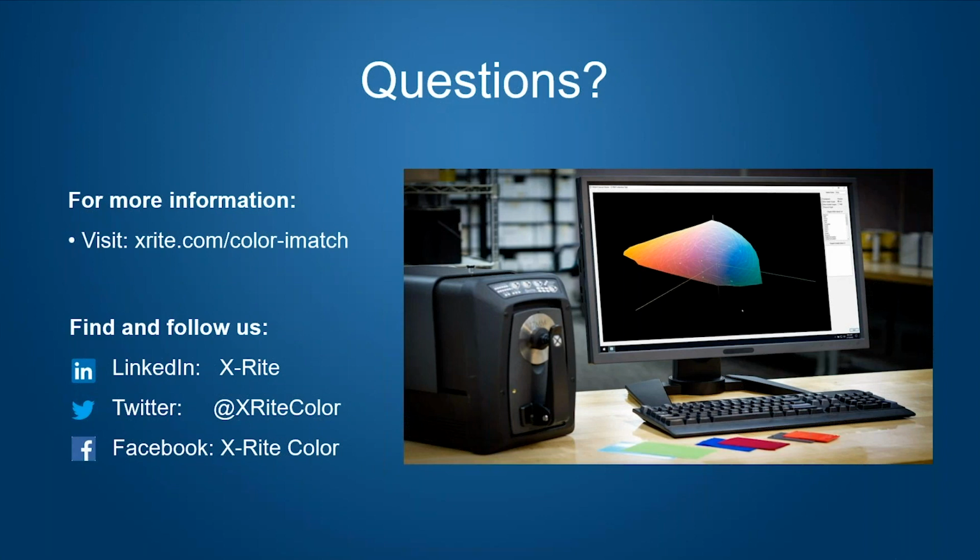Obviously, in a translucent situation, the ability to measure the sample or the standard in both reflectance and transmission, and apply those new metrics to the data coming from both sets of data that we've measured in this new engine, is what's going to drive us to matching not only the color but also the opacity or translucency that you've got in the standard that you're trying to achieve.